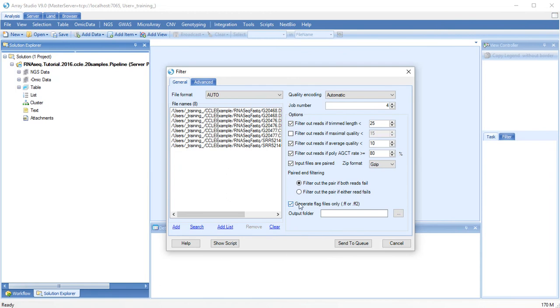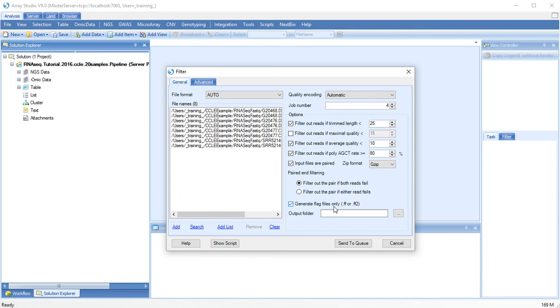With the exception of adapter stripping, when you filter or trim reads, you have the option of either generating new fastq files or, to save space, you can generate a flag file. Array Studio will recognize this flag file which contains information about which portions of reads to ignore. When the flag file is generated, it should be placed into the output folder when you align.